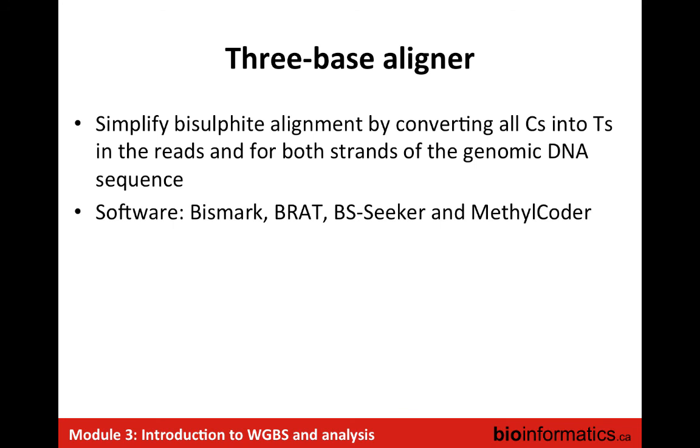The other approach is this three-base aligner. I have a figure, and then we'll see some examples. So the second approach is really the three-base aligner. You convert, a bit like you do with the bisulfite treatment itself, all the Cs into Ts in the reads, and for both strands of the genomic DNA.